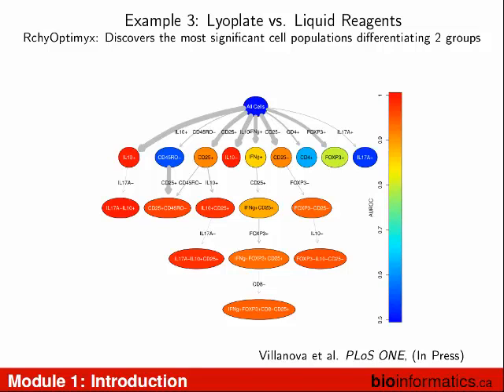And so the question is then, are these lyophilized reagents working the same as liquid reagents? So here's all your FCS files, here's labels in an Excel spreadsheet, here's all your samples that are lyophilized, here's all your samples that are liquid. Is there a difference? Well, yes, there is. IL-10 is different between liquid and lyo. So maybe we want to be aware of that. Maybe we want to figure out what's actually going on here. Is one better than the other? That's up to you guys to understand as biologists. We're just telling you there's a difference here. And it's a very significant one.